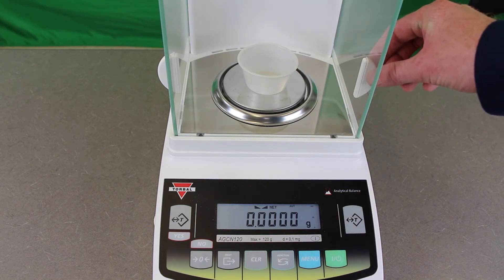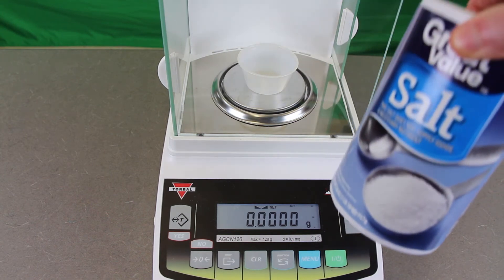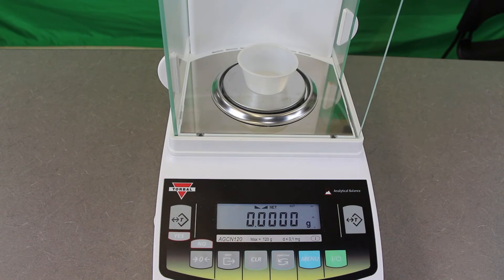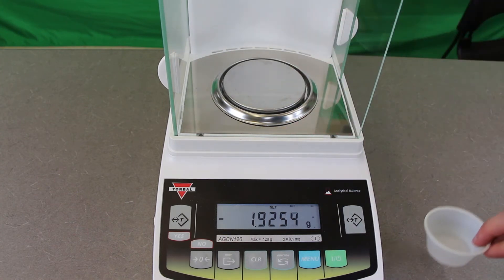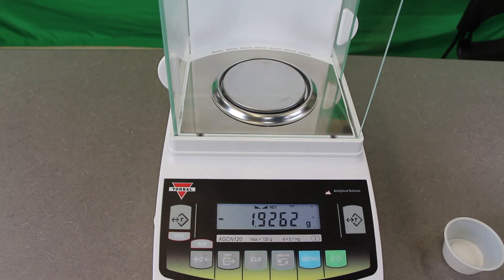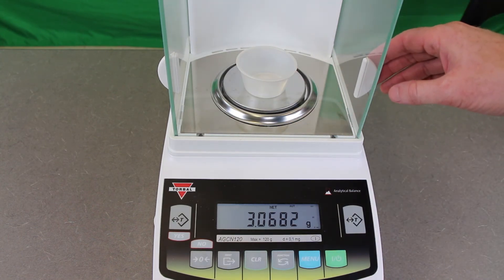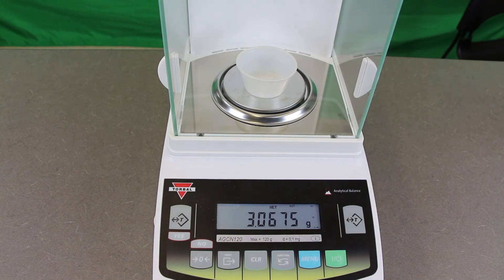Now to weigh whatever it is we're measuring — in this case we're going to weigh a little bit of table salt. Take it out of the scale because we want to be very careful not to get anything inside, pour a little bit into our sample cup, and very carefully put it back inside and close the container. Because we zeroed out the weight of the cup itself, the scale is now showing us the weight of just the salt — not the cup and the salt. We have 3.0673 grams here.